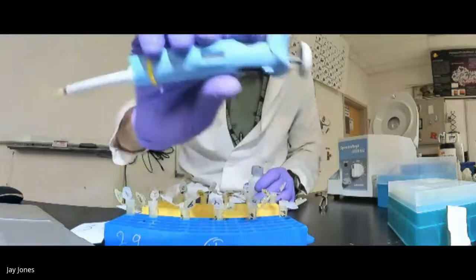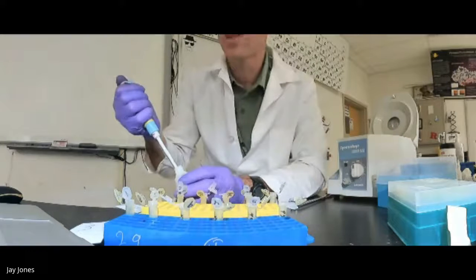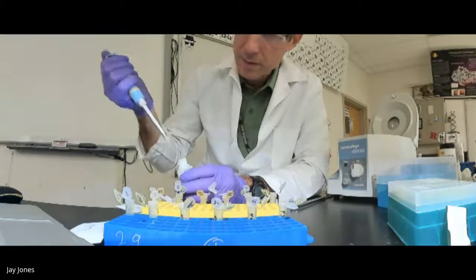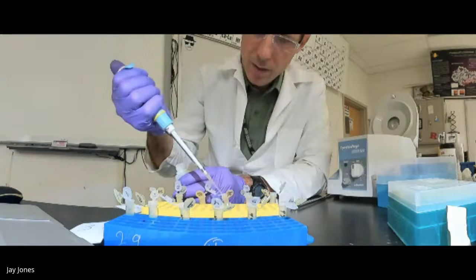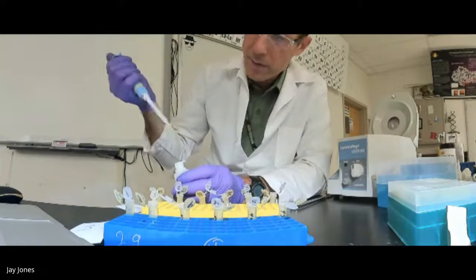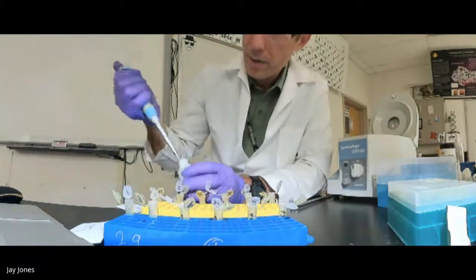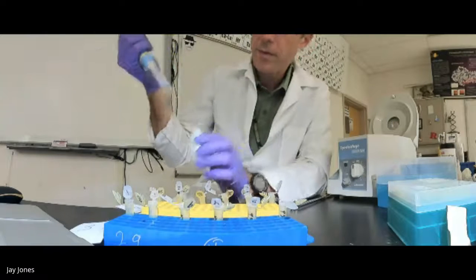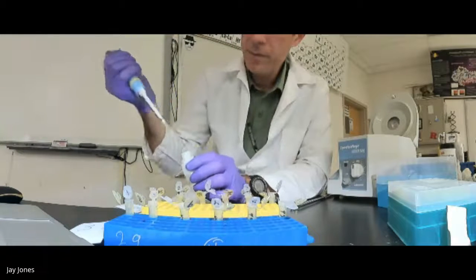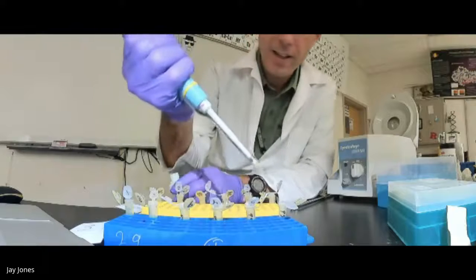All right, here we go. I'm dialed to 60. Elution buffer. I'm going to work period 12 first. Here we go. I got to make sure I watch the 60 go in. T1. T2. T3. T4. T5. T6. Now period 3. T1. T2. T3. T4. T5. and T6. All right.